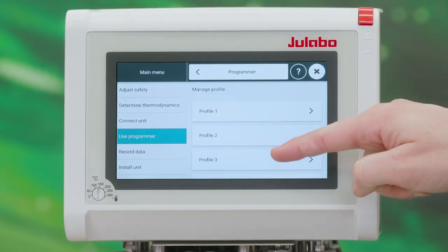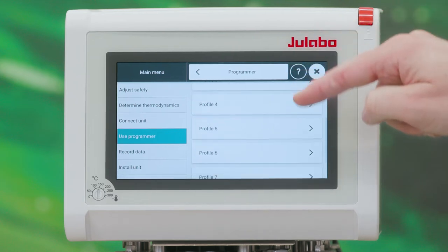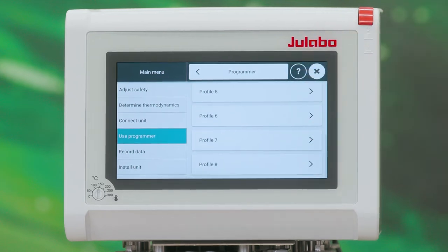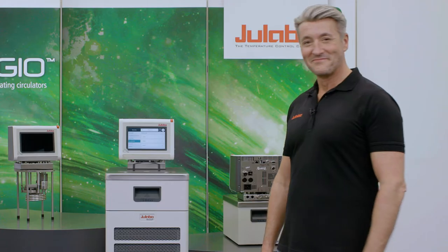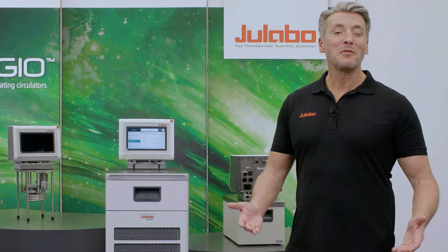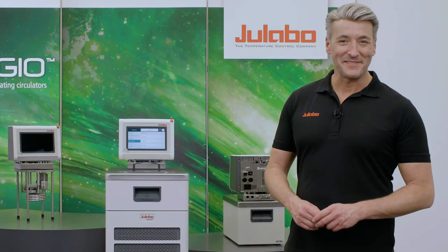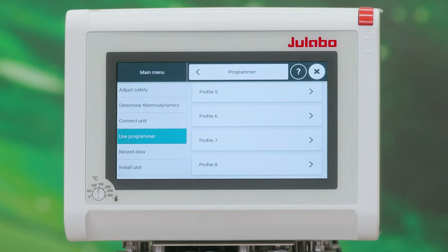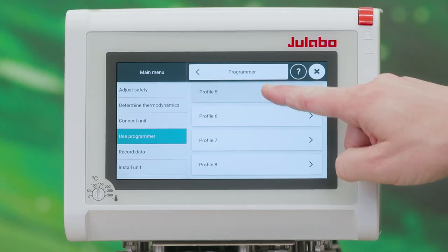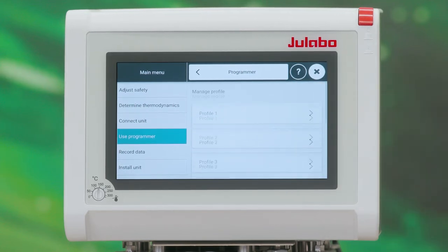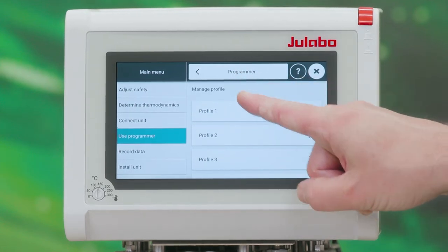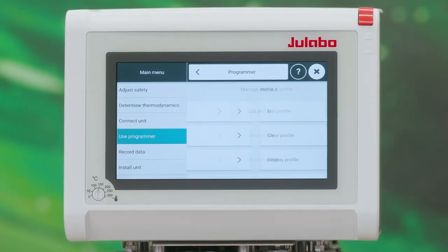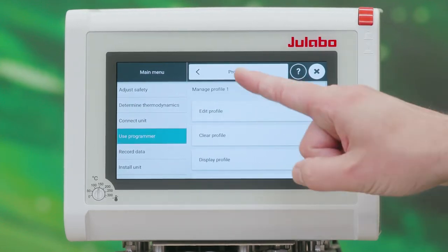Up to eight different profiles can be predefined. I will show you an example. To edit one of the profiles, choose the profile and then Edit Profile.